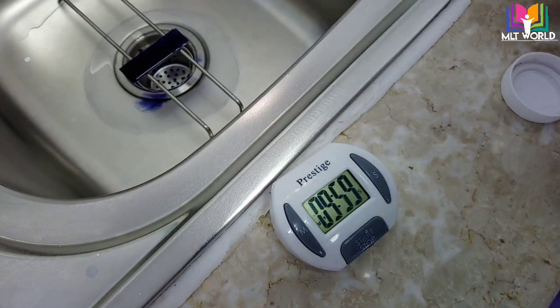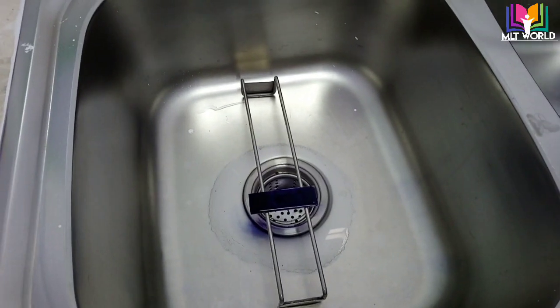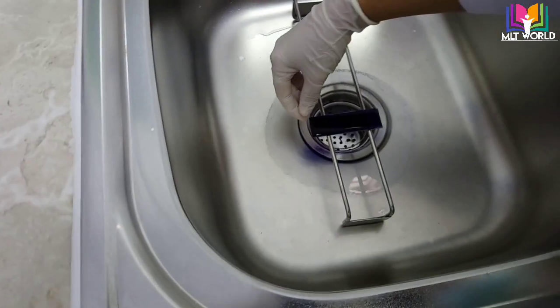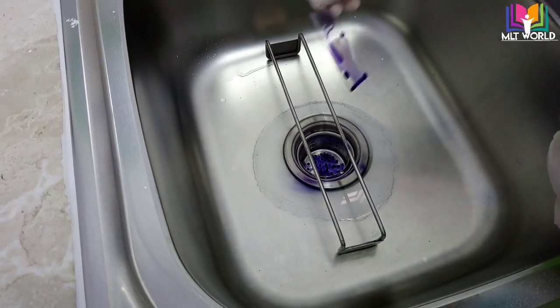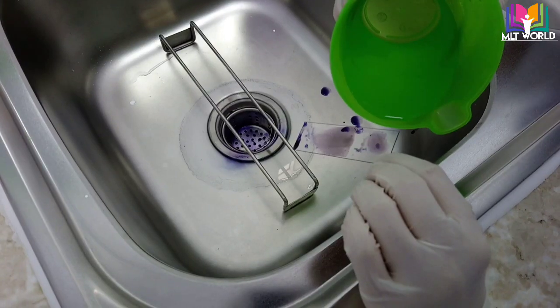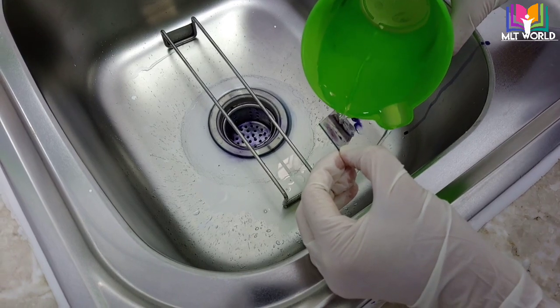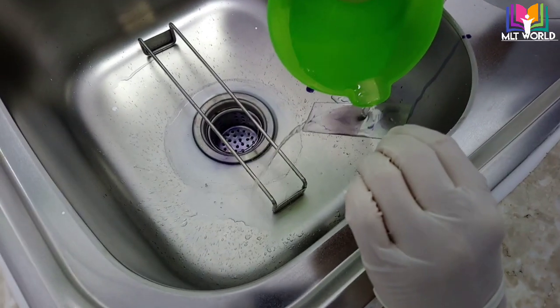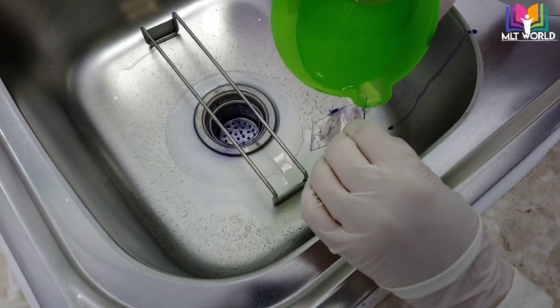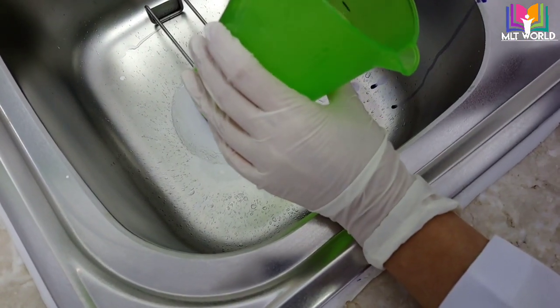After 10 minutes we will do the washing, and washing is a very careful procedure especially for the thick smear. First, drain or drop off the stain. Then take a glass of water — tap water is fine. Wash the back side of the slide first, then the front side. Be very careful: don't let flowing water hit the thick smear directly, as you can see the smear can wash off.